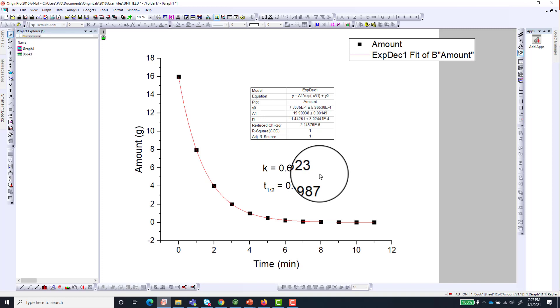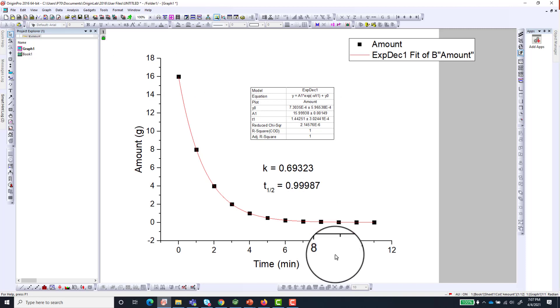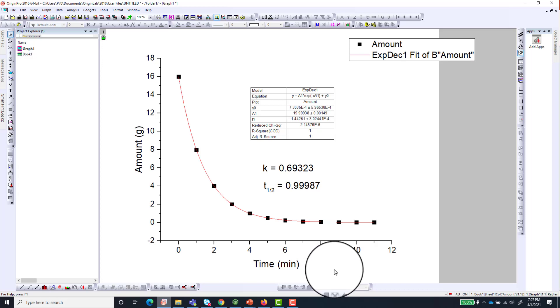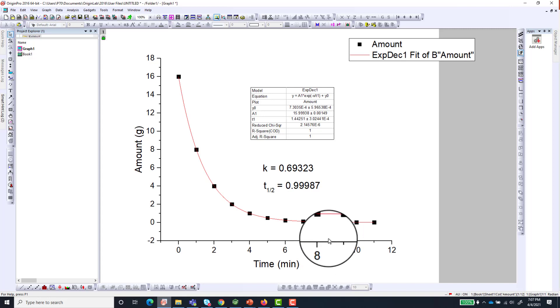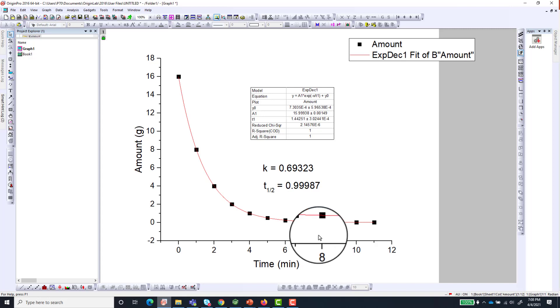Other things that you might need to do is format this graph before you export it out of the Origin program for your presentation or for your manuscript as the case may be. And I already made a video about that in my first Origin tutorial, the Origin tutorial number 1. So you can go back to that tutorial to see how to get a beautiful picture or a beautiful graph after this kind of fit.